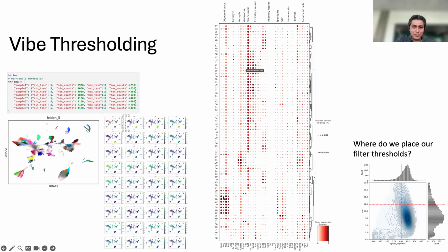And to check yourself on those assumptions, once you've annotated your cell types and made your gene activity score matrix, make a dot plot out of that. You can treat this similar to how you would treat an RNA-seq analysis. And if these markers are lining up close enough to what you are expecting, it is a good sanity check.